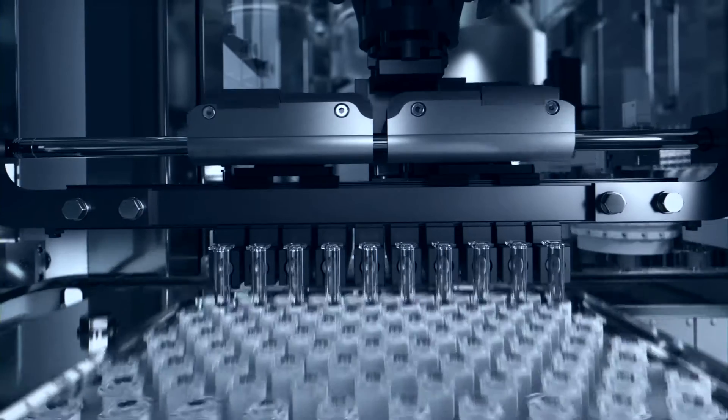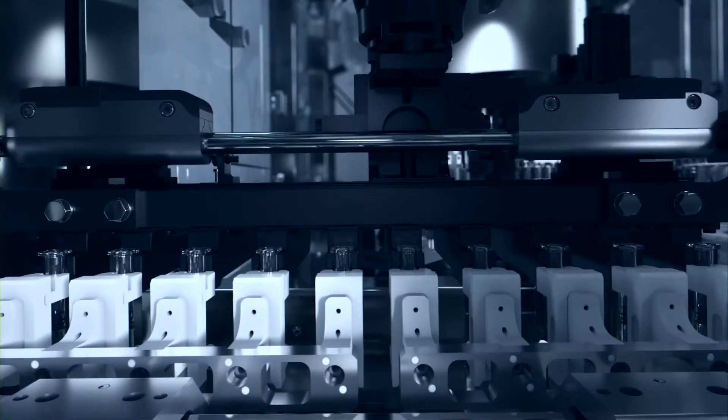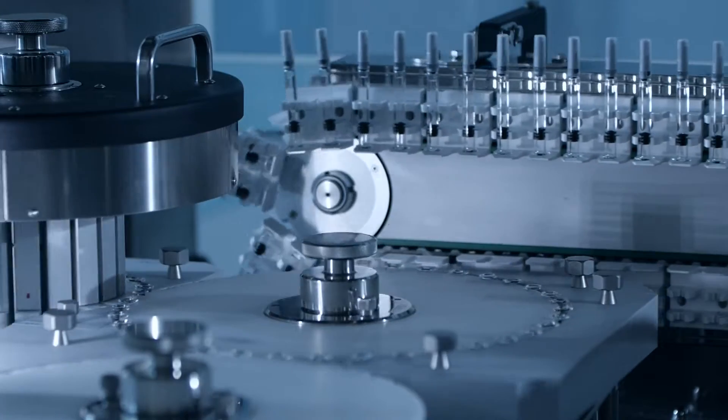The upgraded, sophisticated, no-contact handling system totally eliminates the presence of worm screws from the design to assure a real no-friction concept, ideal also for plastic syringes.